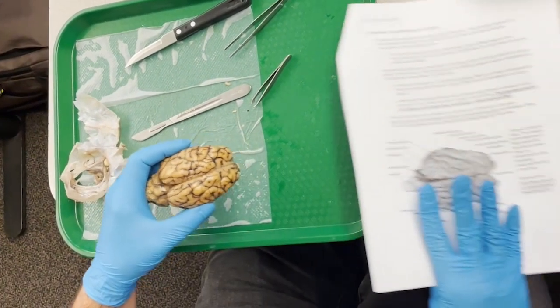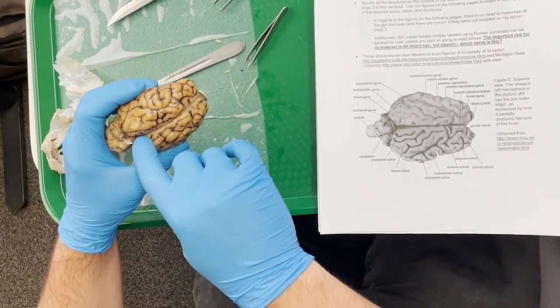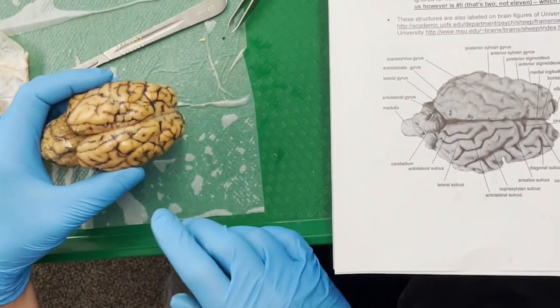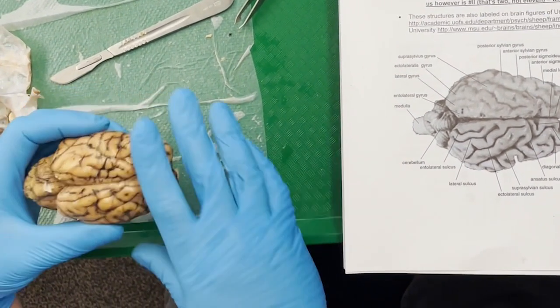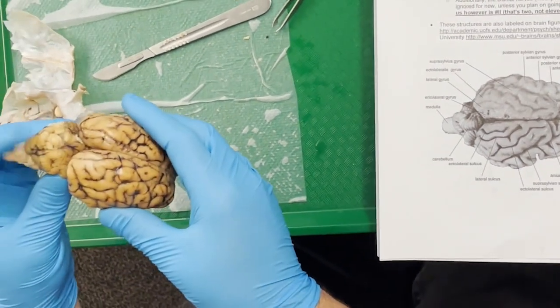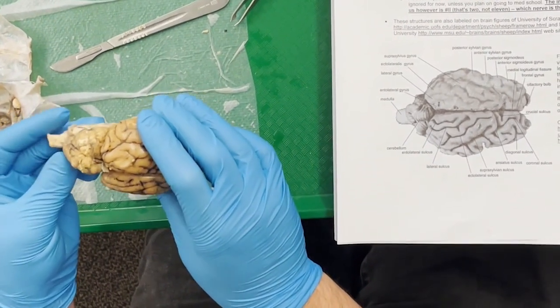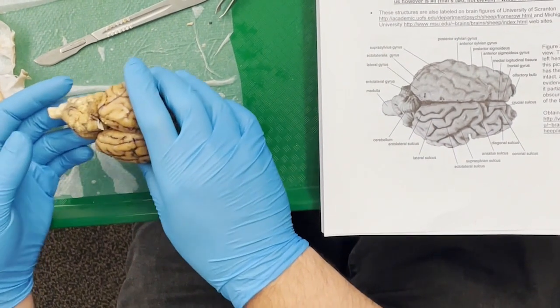We see in this packet, there will be the mid-longitudinal fissure, the division between the hemispheres, the very large crevice there. There are various other gyri and sulci that I'm not so concerned with. We obviously know about the cerebellum, the large, much more wrinkly mass in the back here. And then we have the brainstem underneath, specifically the part that's sticking out in this diagram, and from our point of view would be the medulla, the lowest part of the brainstem.